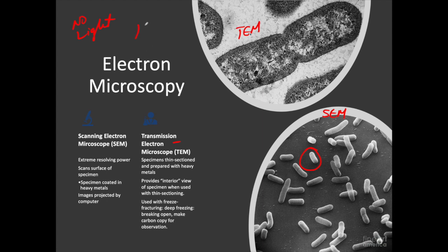And electron microscopes are kind of like big boxes like this, and they have a huge, giant, long tunnel, and they have a bunch of cameras in here. There's a camera inside of here, and then all of this is linked over here to a computer. Just draw my little computer there. So it's all linked to a computer, and these are photographs taken by the microscope. Now, what's happening here is the bacteria are prepared on a slide, and instead of adding a dye or a stain, let's take SEM first, the bacteria are adhered to a slide, and then they are dipped in a gold solution. The heavy metal layer is incredibly thin, just a few nanometers thickness, in order to coat the specimen.